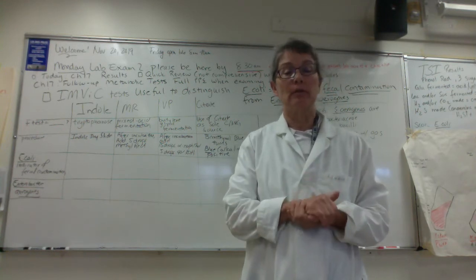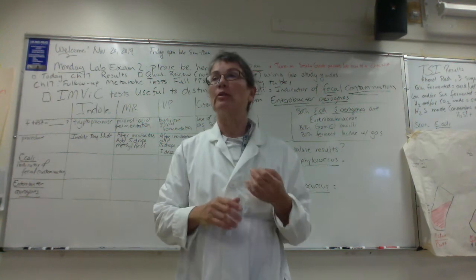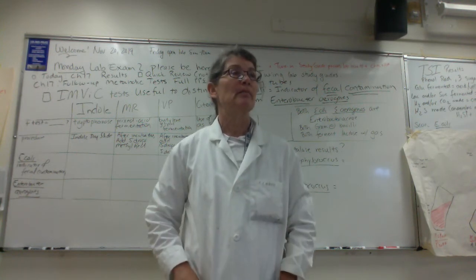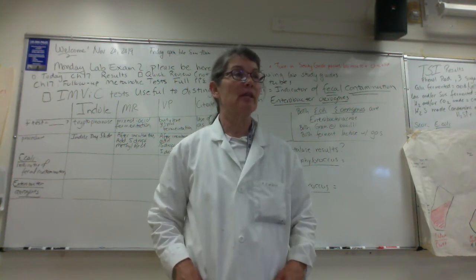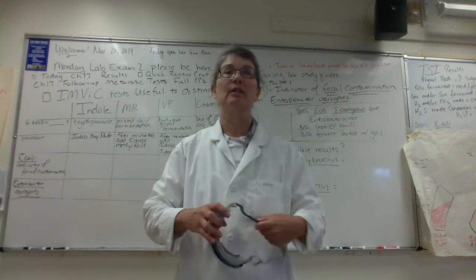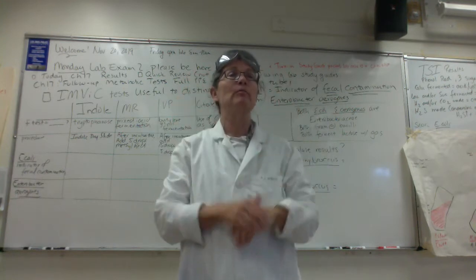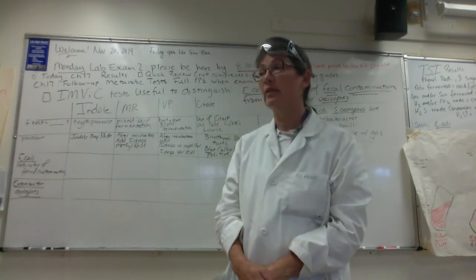So first of all, folks, with the IMViC, let me just quiz you. IMViC is actually 4 different tests. So what does the I stand for? Indol, right. So you guys, if we have a positive indol test, what does that tell you about your microbe? This would be the interpretation. Exactly. If your microbe makes indol from tryptophan, it means your microbe makes the enzyme tryptophanase, right?